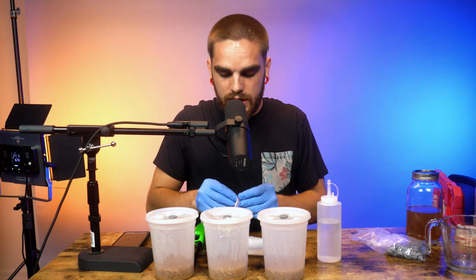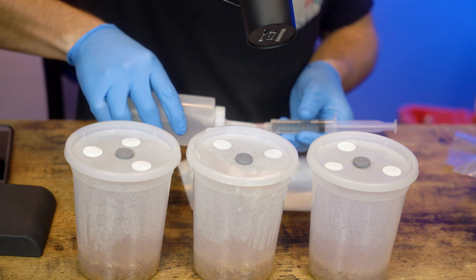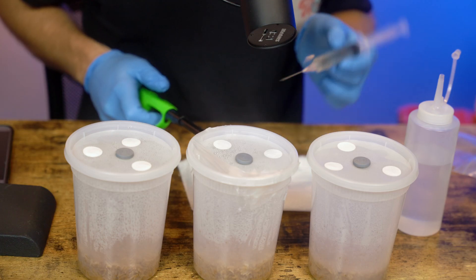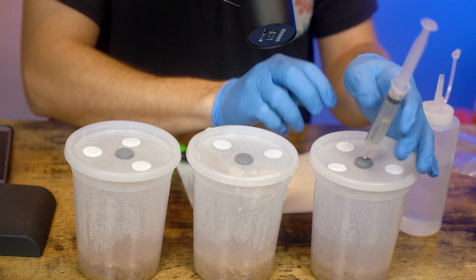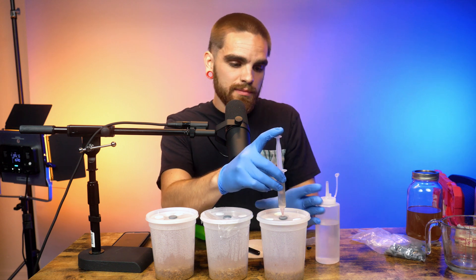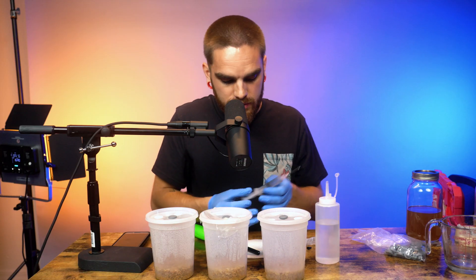When inoculating, make sure everything is nice and sterile. Get a good amount of rubbing alcohol on there and put some fire to it to sterilize the needle. We're only going to do about a third of the syringe into each jar. When you inoculate, go in a little circle and then a bit in the middle so it spreads around the edges. Wipe off your injection port too after each inoculation.